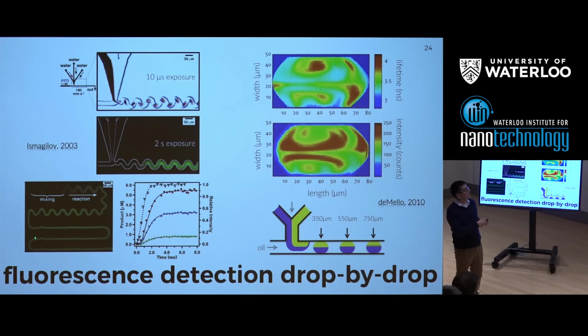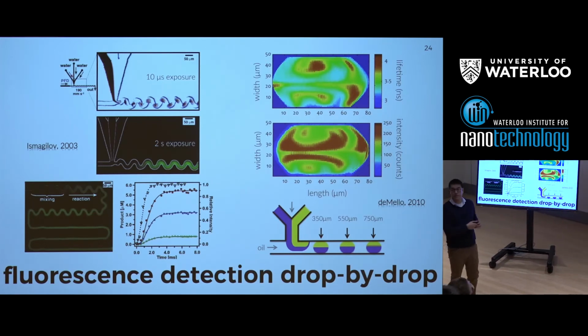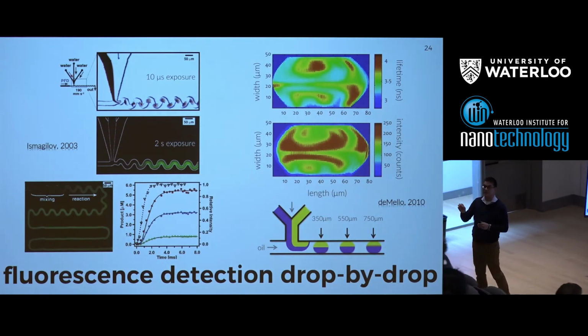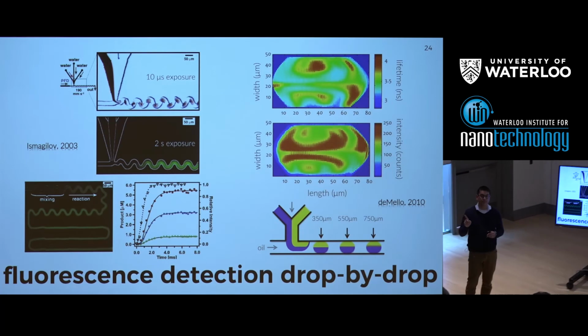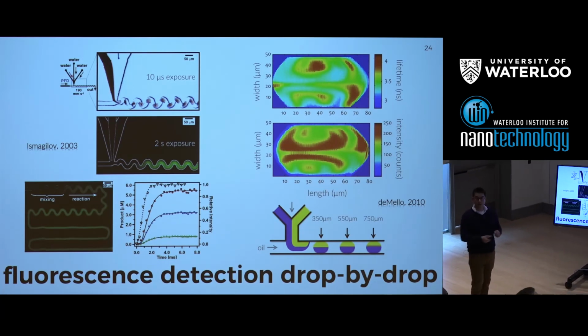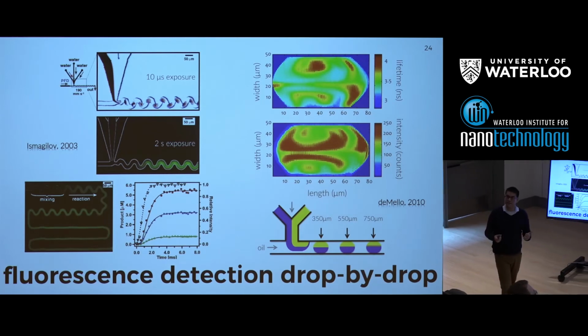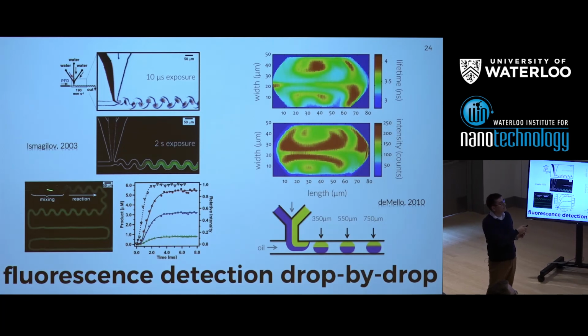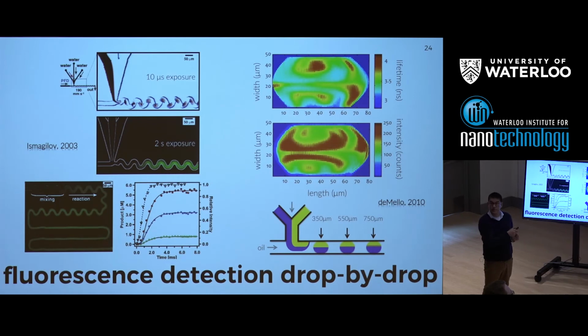But look at what we're looking at here. This is all blurred, and that's because our droplets are moving too quickly. Now, if our droplets are identical, that's not a problem, because we can just repeat the experiment, and so he builds up these curves. But I showed you at the beginning, it's very easy for us to vary what goes into each droplet. In this case, if he varied the experimental conditions, he couldn't extract that information because we've got this blurring. So this is a big problem.